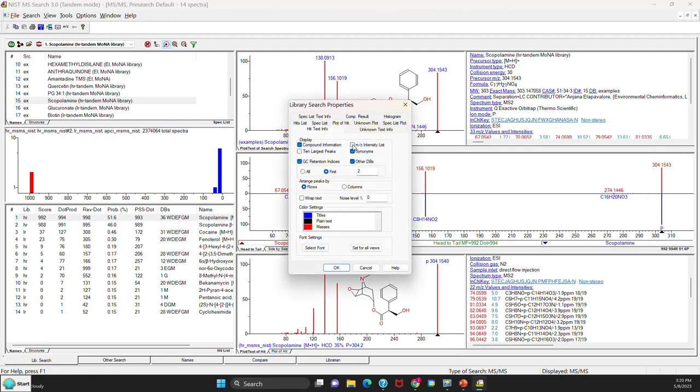And I turn off the mass to charge intensity list. And also wrap the text so things that might go off the right side of the screen are now rolled over so you can see the end of the stream.